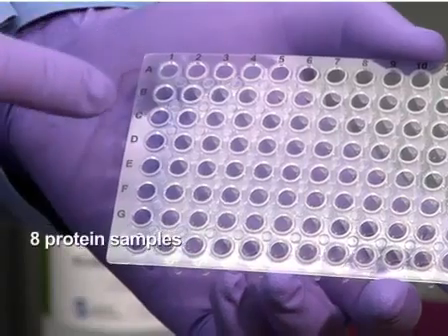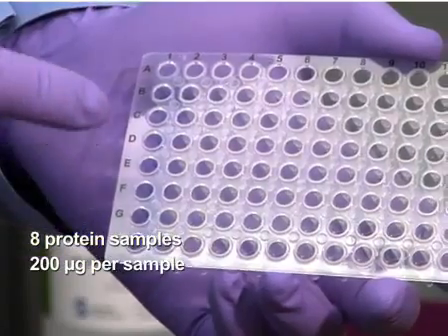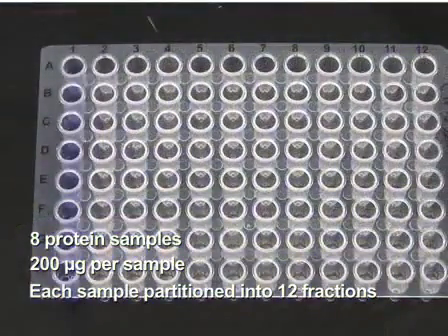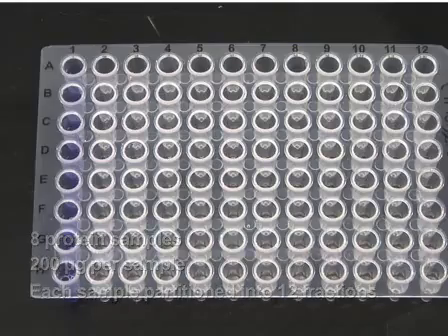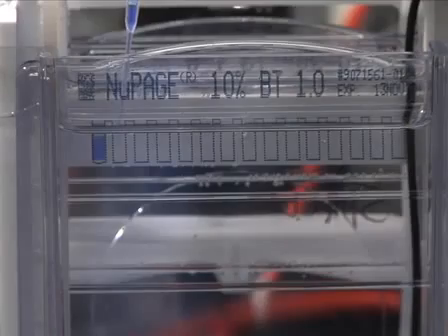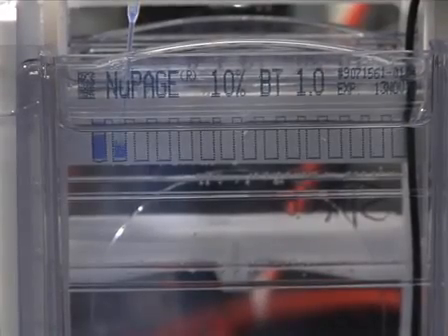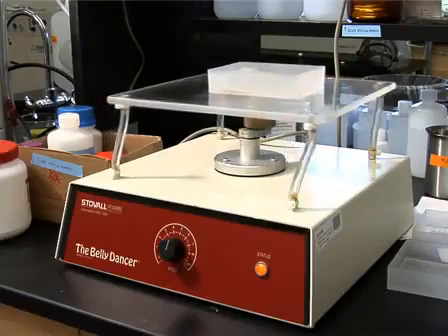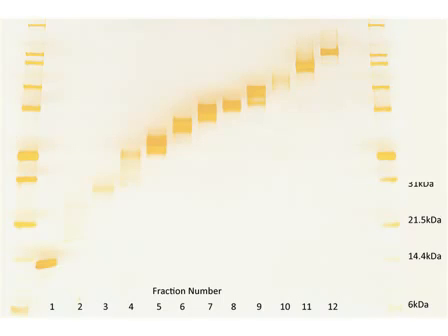In this demonstration, eight protein samples at 200 micrograms each were partitioned into 12 fractions each, for a total of 96 fractions. To visualize the results of the fractionation, an aliquot of each of the 12 fractions from the bovine liver homogenate sample was run on a standard 1D gel and silver stained. As shown in this figure, the protein sample was fractionated into 12 distinct fractions spanning the molecular weight range from 3.5 kilodaltons to 150 kilodaltons.